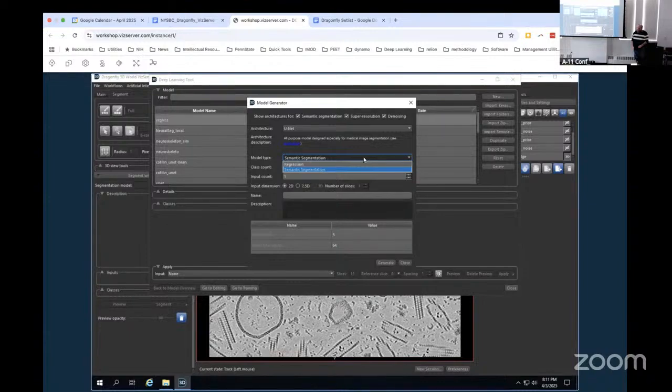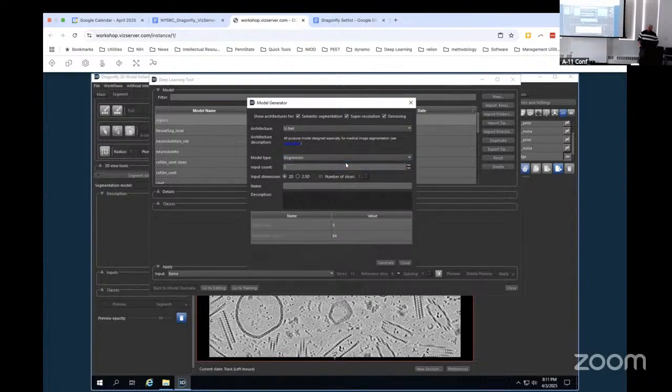Is the output of this a denoised image? Yeah. So it has to have every voxel, right? Well, it does every voxel, but segmentation is for a subset of voxels. It's just that one of them is predicting class identification, and the other is predicting a voxel value. Yeah, exactly. It spits out a continuous value for what the intensity would be at that pixel.